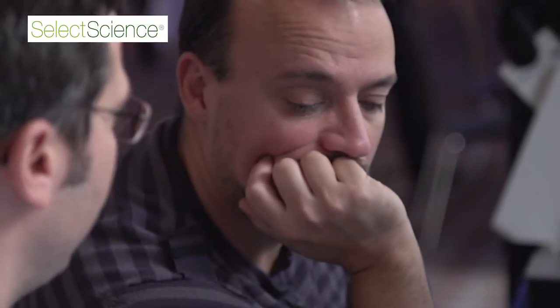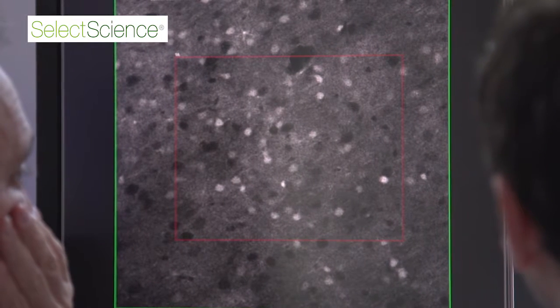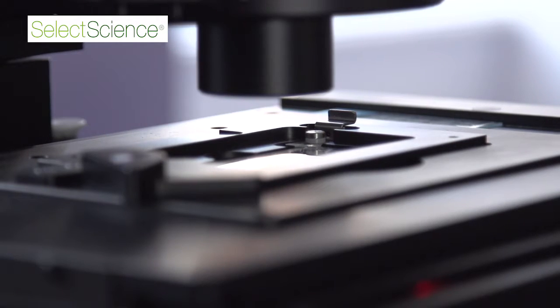Confocal microscopy, spinning disc, and we also do a lot of light sheet microscopy. So my interest in the microscope will be directed through the support and the capacity of the microscope to answer the questions of the researchers I'm dealing with. So the most important thing for them is to get a fully functional microscope every time.